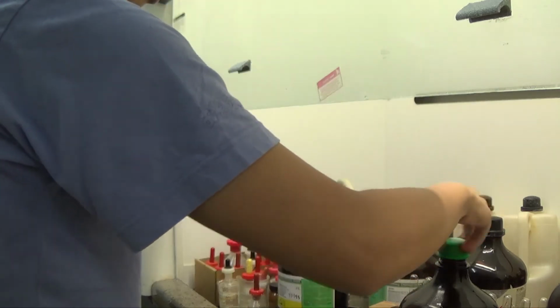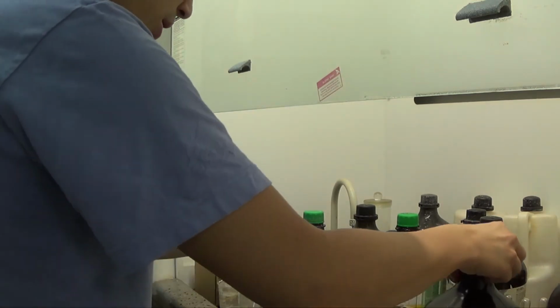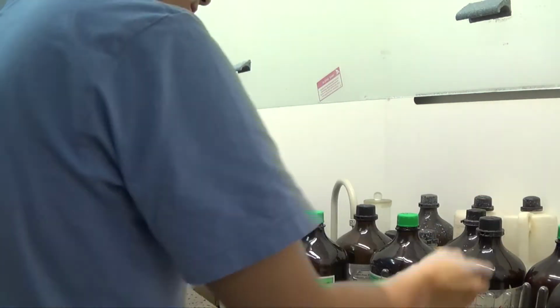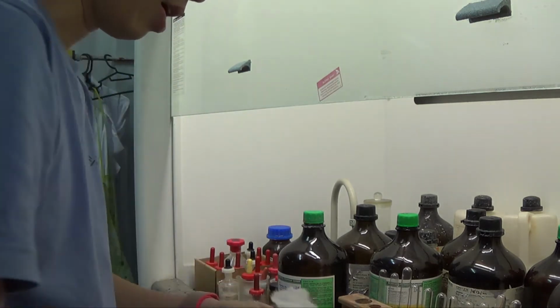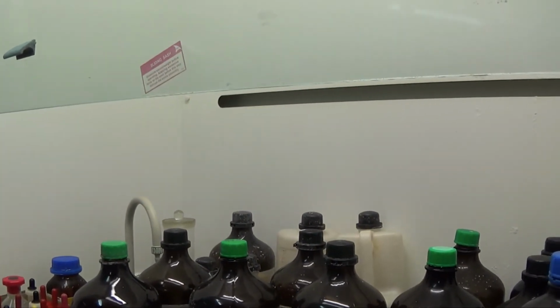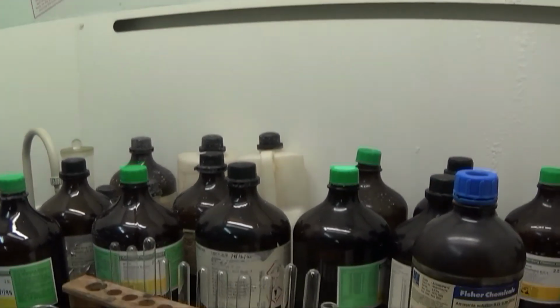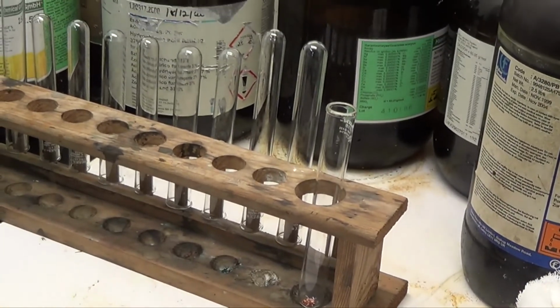So I started filming a little bit already, and I should clean out my mess. Okay, so I have my array of test tubes. Put back my nitric acid where it's supposed to be. And this is my copper metal. Let me see, is that clear or not? Give me a minute. Okay.